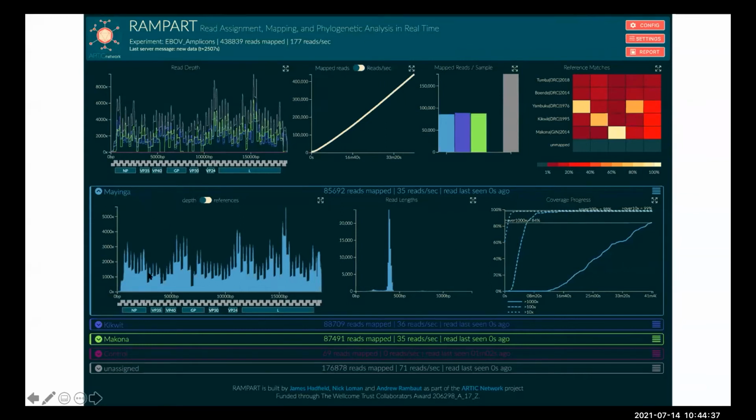So you can see whether or not they have sufficient coverage that you can stop the run. And there are also a few overview plots here showing all of the coverage overlaid, the read collection from the run, and also the number of reads for each barcode. So it's a useful software for monitoring runs if you're a lab type person and you just want to get a really quick view of what it looks like.